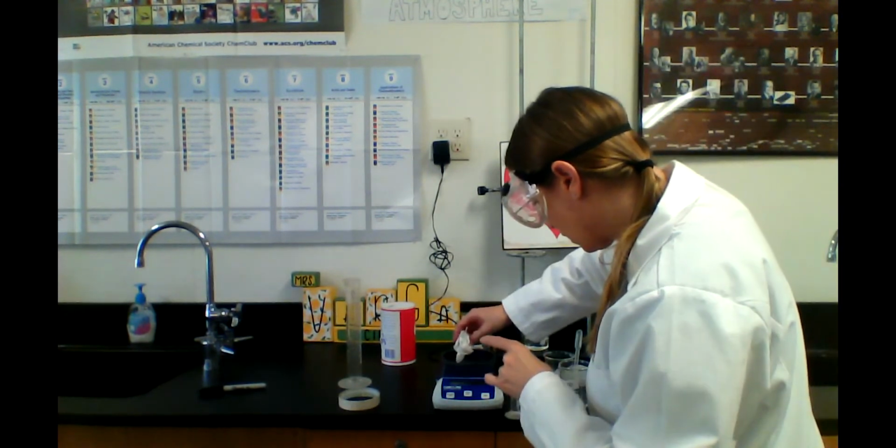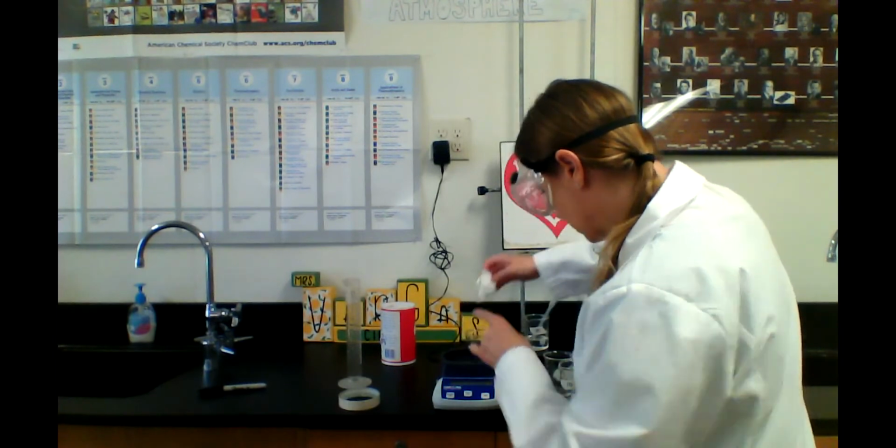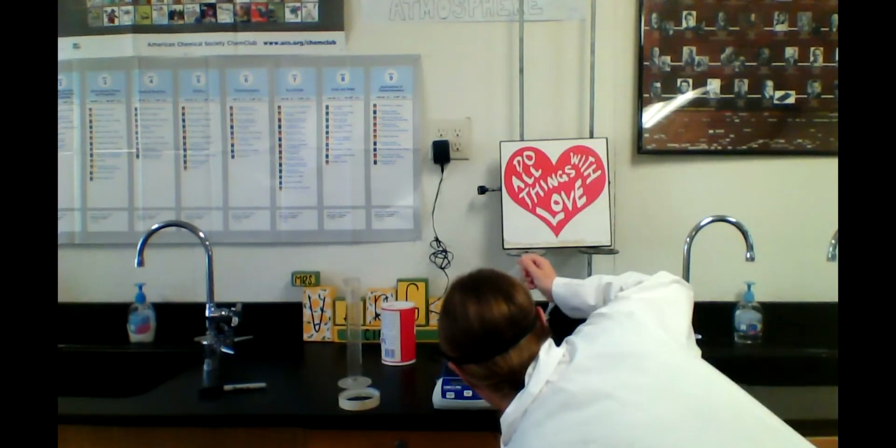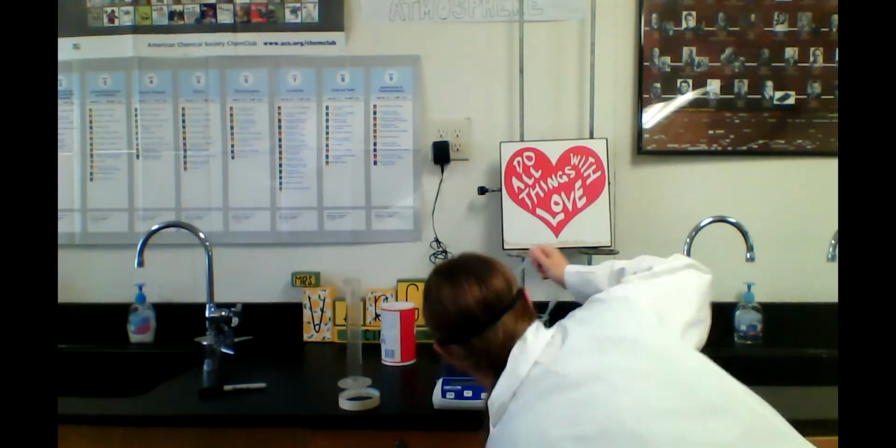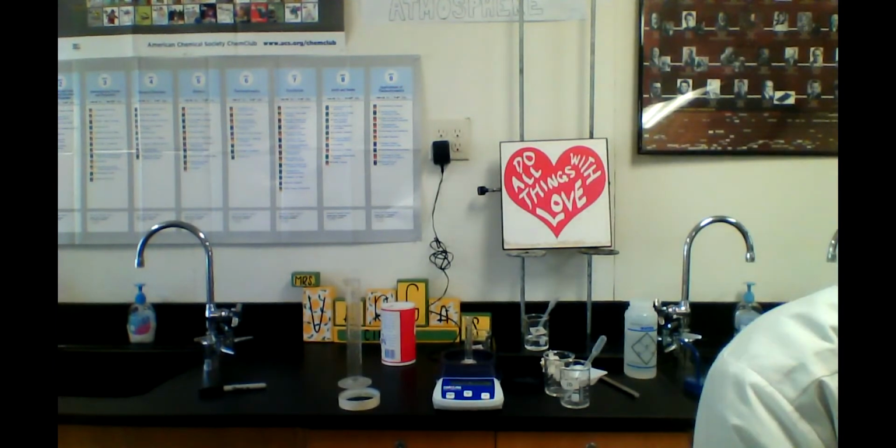I'm going to very gently, because these are sensitive, wipe this off. Put that back on there. All right, so that little extra mass would have made a tiny difference there. And let's get this up to the 10 milliliter mark. Right there. Okay, so our 10% solution, this is looking beautiful, has a mass of 10.42 grams. And that is 10.0 milliliters.